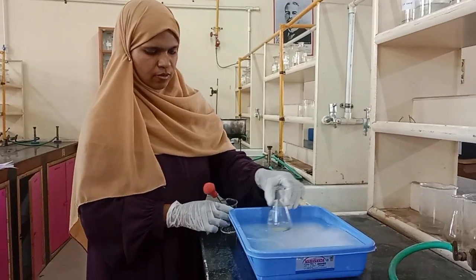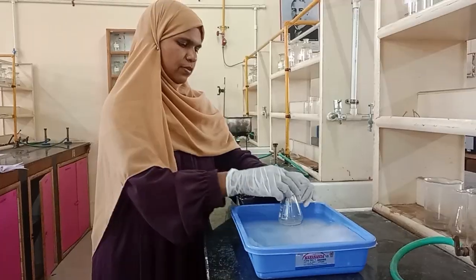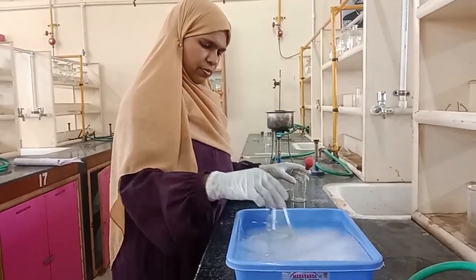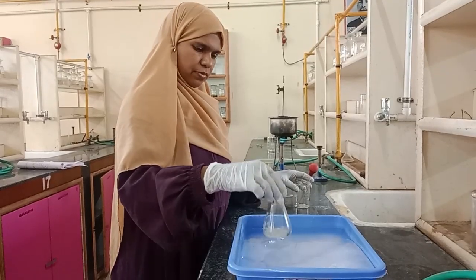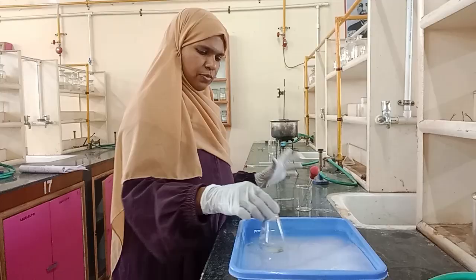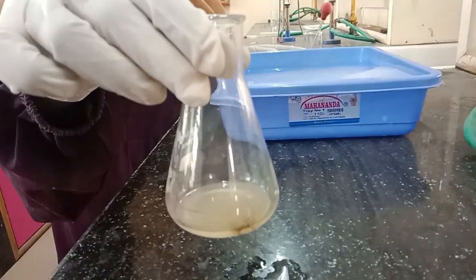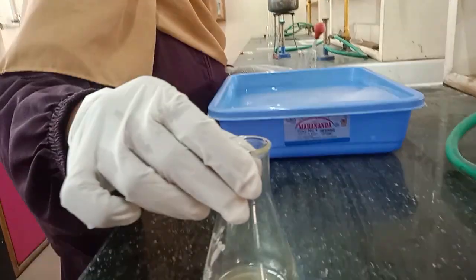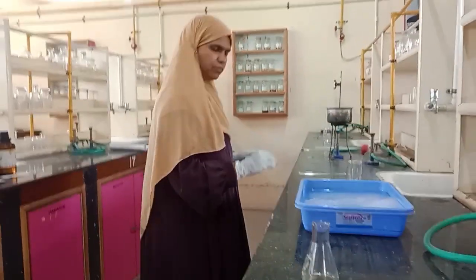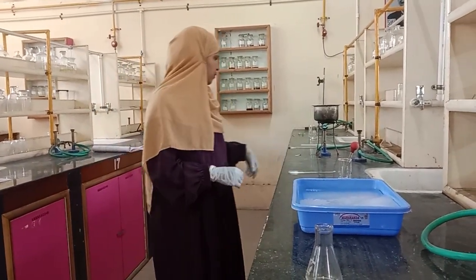You can stir continuously. You clearly observe this change of the solution. First it is a clear solution, then it converted into a precipitate. Now after room temperature, you heat it in a water bath up to 40 degrees centigrade.